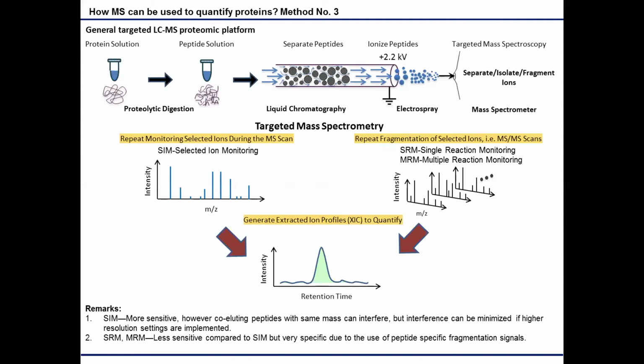What's interesting about mass spectrometry is you can also use a counting method. I imagine that Dr. Wisharatna might get to that. But in addition to that, we can actually get a measurement of the total intensity of the number of ions, right? And that's an inherently quantitative value, and it's very different than what you get with high throughput sequencing.